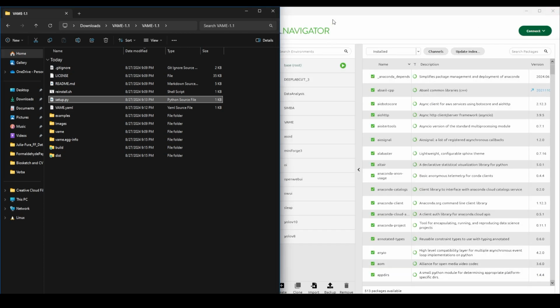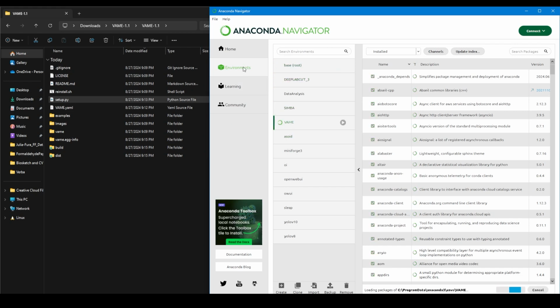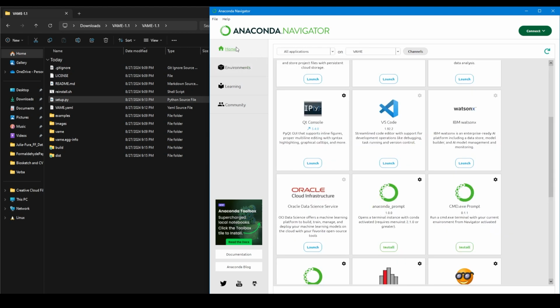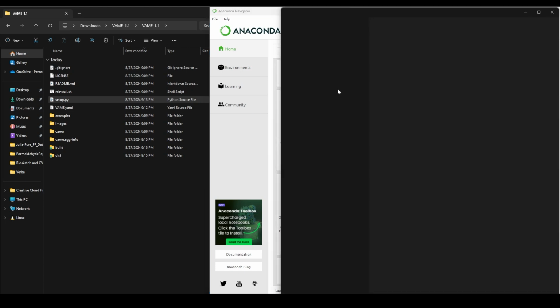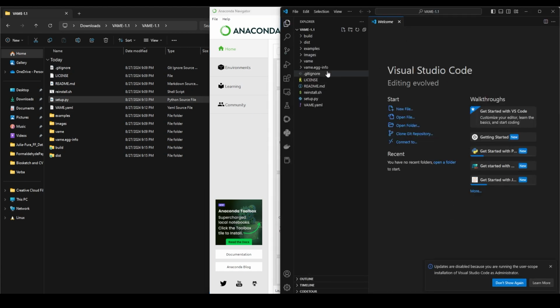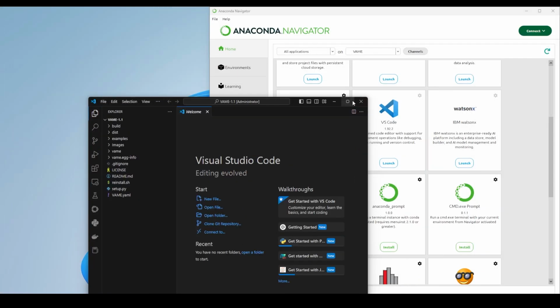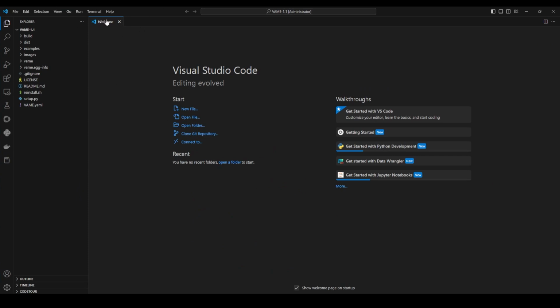So next I'm going to utilize Visual Studio Code. And by utilizing the VS Code, this makes the integrated command workflow very easy. Now you can also utilize Spyder here. I just prefer Visual Studio Code. And here I'm opening my folder in which my GitHub repo was unzipped. And from within this folder, I'm going to create a new project file. And this is going to be my Jupyter script.